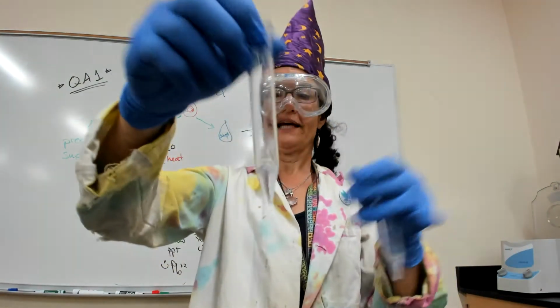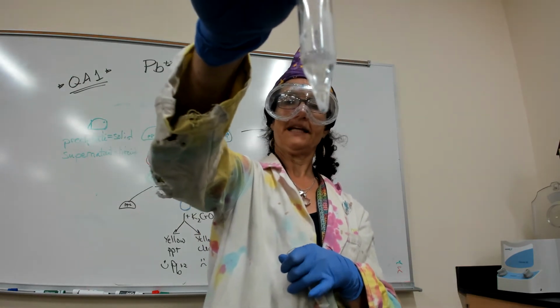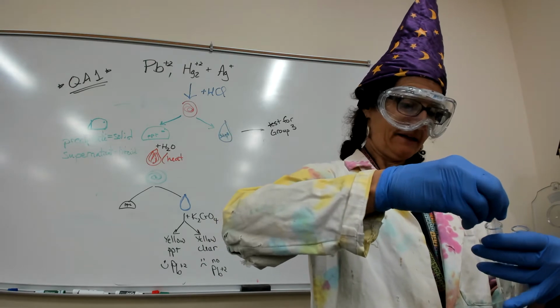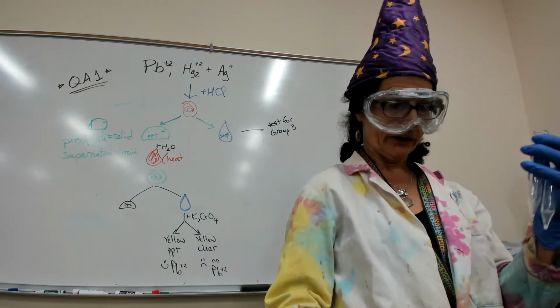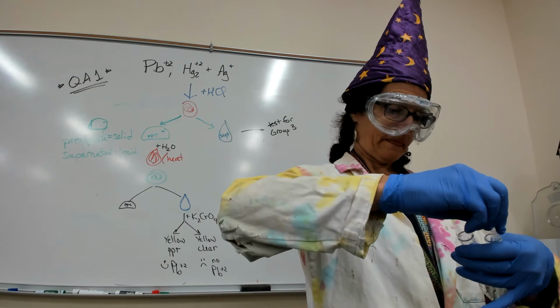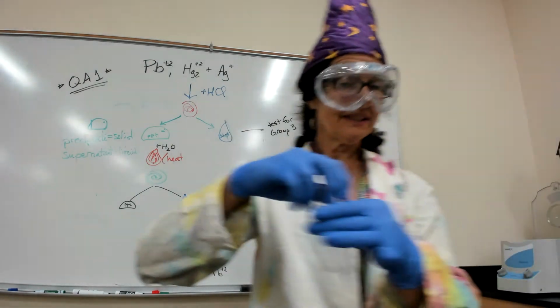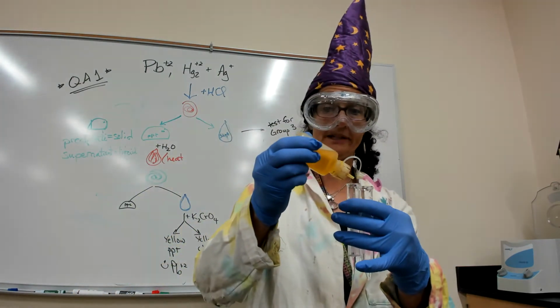All right, so again, we separated. I don't know that the camera picks up the precipitate, not really well. All right, clean pipette, and put the supernatant in another tube. I have 2 samples because I want to show you what the yes-no means. All right, so these are my supernatants. Left the precipitates for a next step, which I believe is step 3 in your instructions.